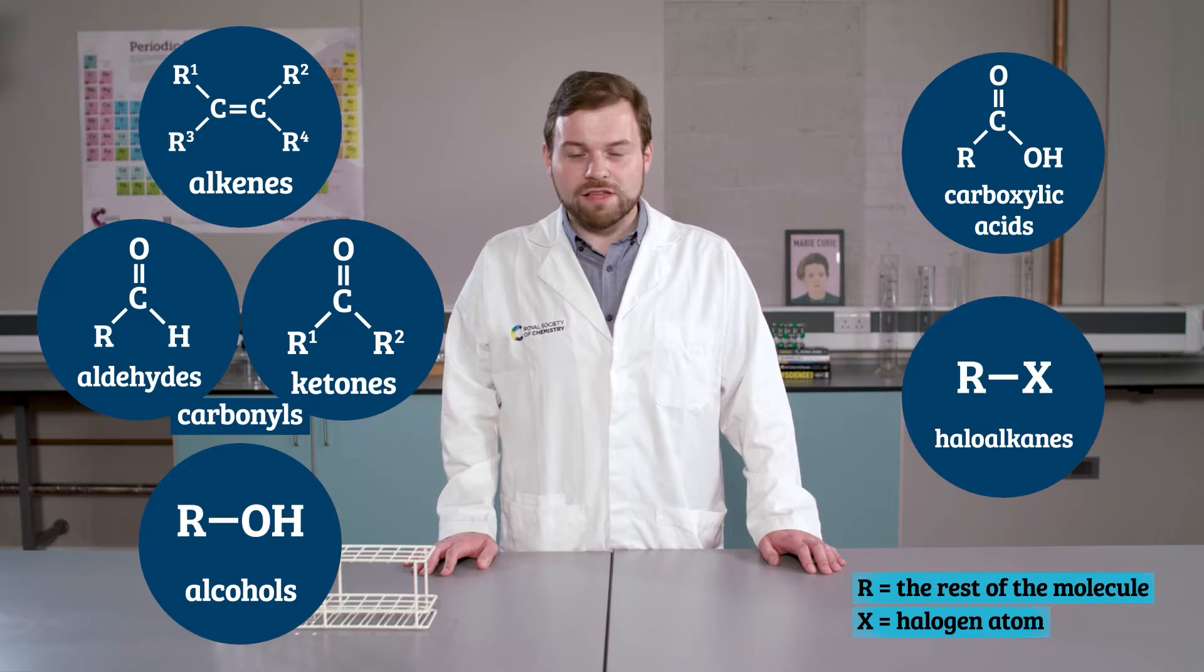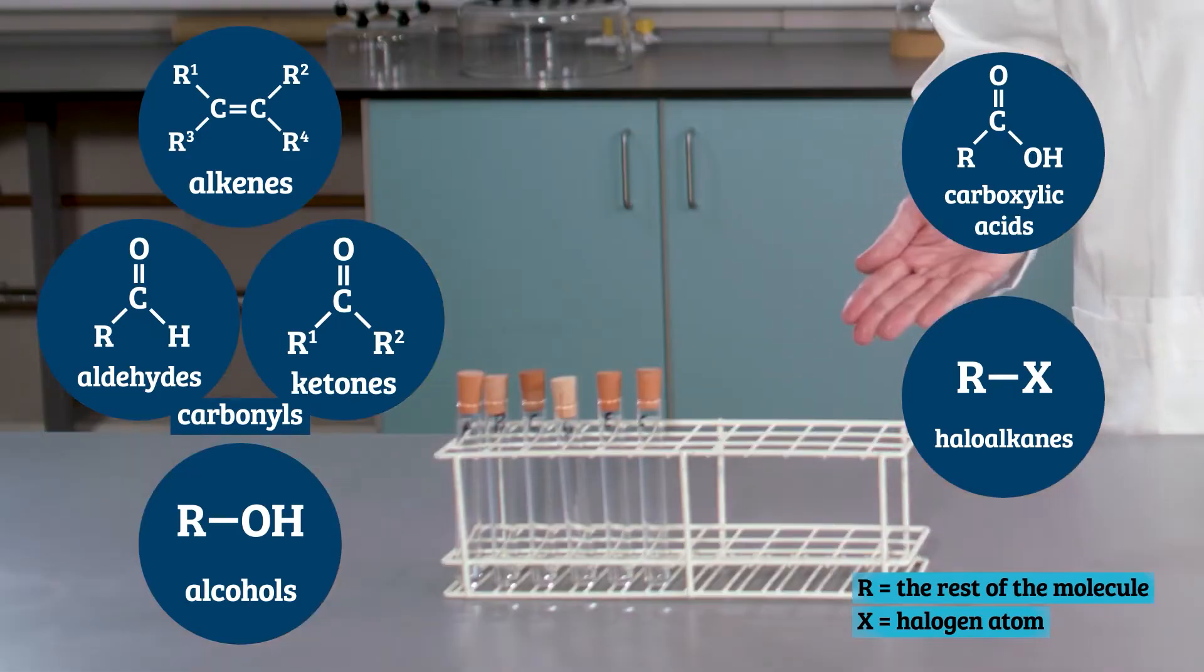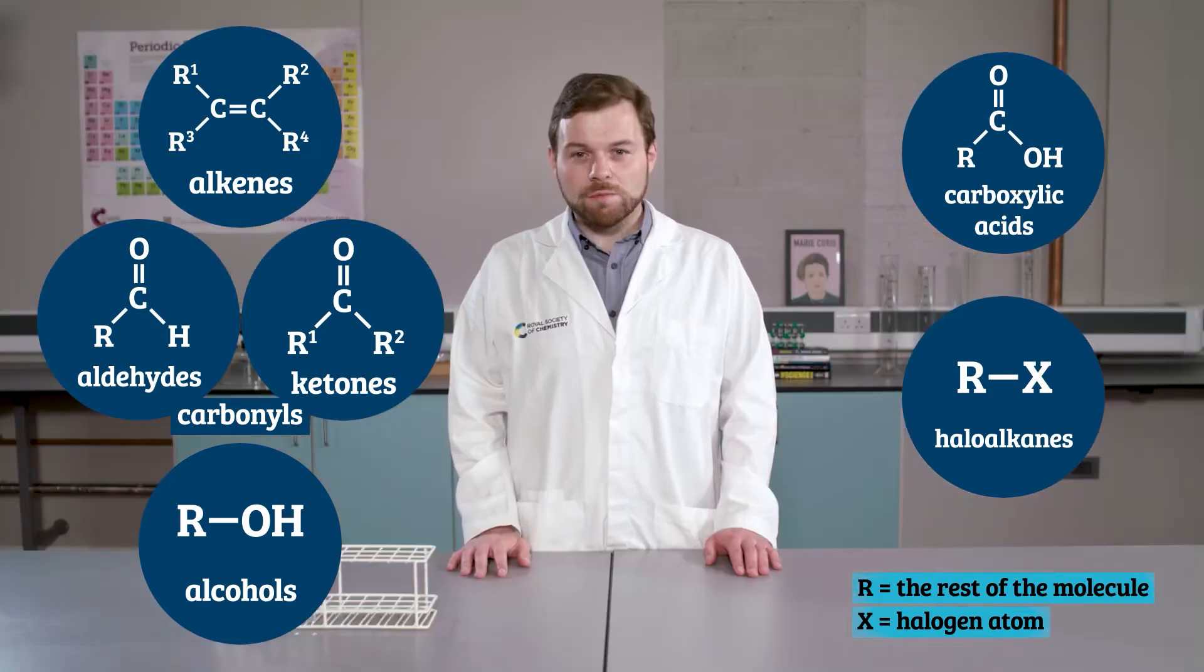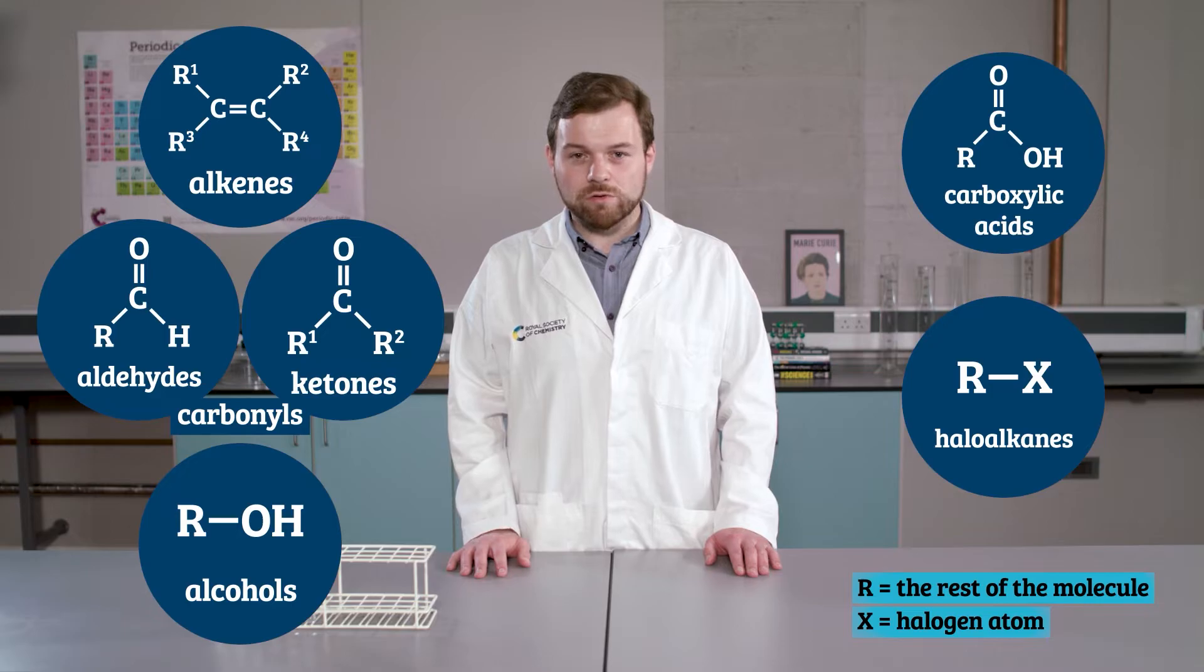Each functional group behaves in a similar fashion by undergoing similar reactions no matter what compound it's in. Here I have six unknown organic samples, each from one of these groups. I'm going to carry out a series of qualitative tests to identify which functional group or groups are present in each sample.